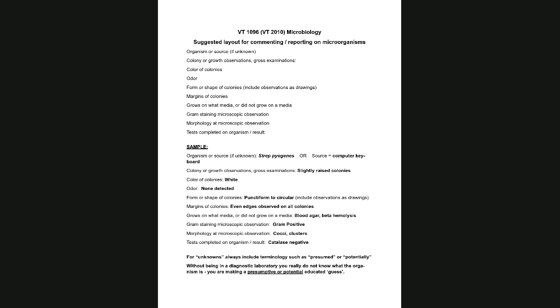And is there a color? Is it yellow? Is it red? What agar did it grow on, and what color is it? That can be different. We will illustrate to you how to do what we call wafting, W-A-F-T-I-N-G, wafting, to see if there's an odor. You don't just put your nose into the Petri dish, you wave your hand, you waft it across that Petri dish area and see if there is a fruity odor. Does it smell like popcorn? Does it smell like dirty socks? And you can use those kinds of terminologies because that's how we list them at times.